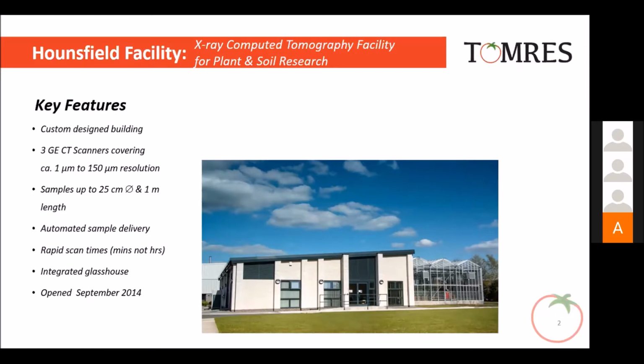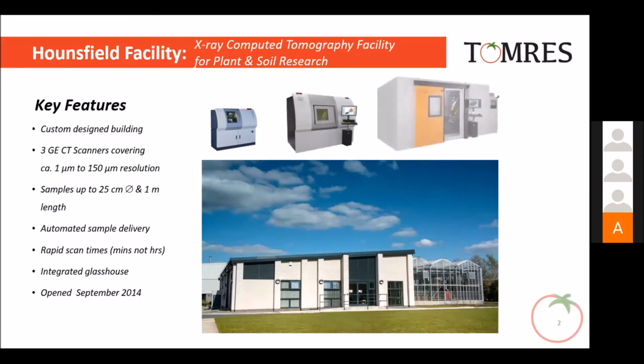As Hannah said, I'm based at the Hounsfield facility at the University of Nottingham. This is an X-ray computed tomography facility dedicated to soil and plant research. It was opened in 2014, and it's a dedicated facility with an integrated glasshouse and three CT scanners that allow us to characterize both the soil and plant root structure non-destructively.